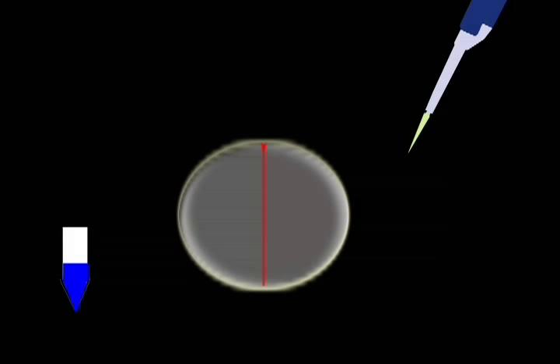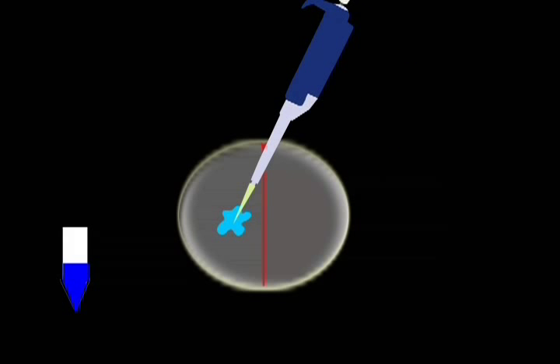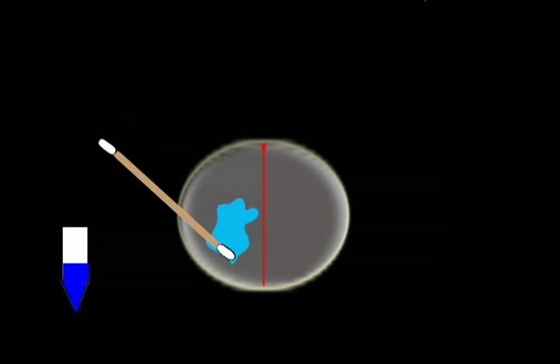We will be placing GFP, our controlled plasmid, and our mutated plasmid on the other side. Spread the cells over the entire platter with a cotton swab.